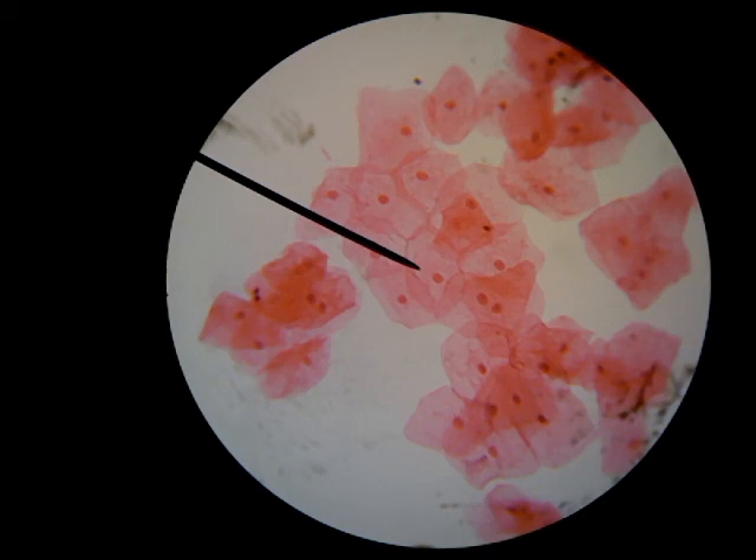So we have animal cells here and this is what they look like. I'm going to go back and take some pictures and post them in my slideshow a little later so you can get a chance to really draw what you're seeing. These are animal cells — nice and pink like people's cheeks, although it is possible that these were dyed, which is common when preparing cells for a microscope slide, just to make them a little more visible. So animal cells, guys: blobs, no cell walls, but still have a nucleus. They overlap and don't fit together as nicely. Bye guys.